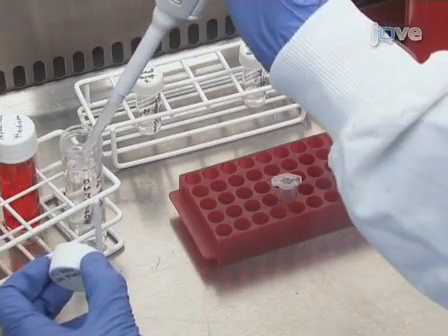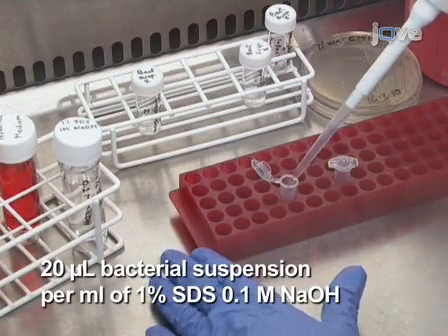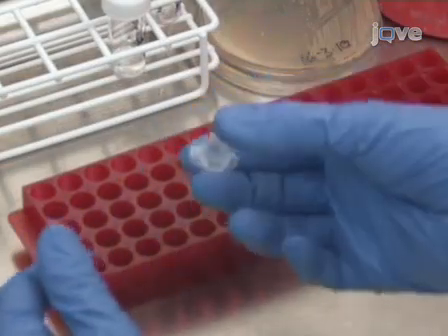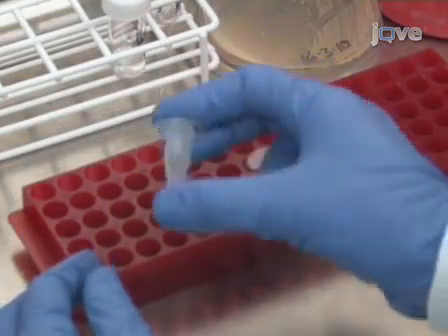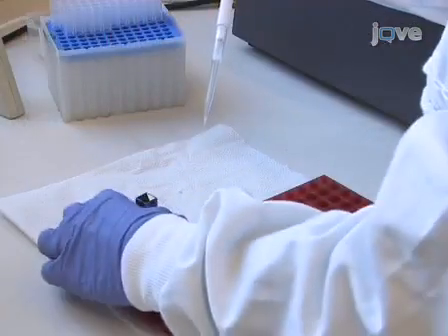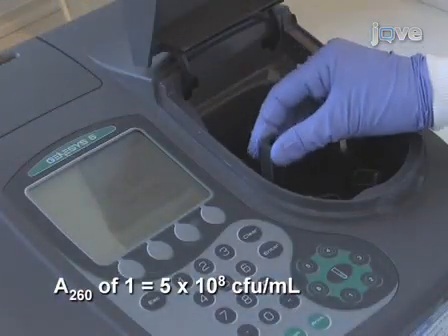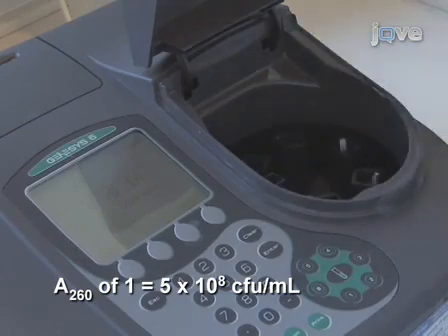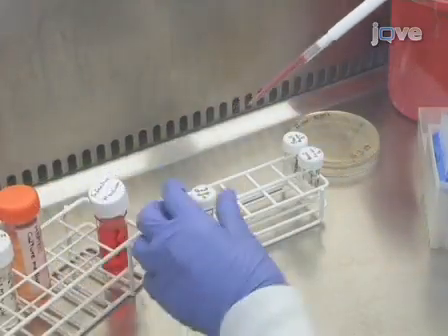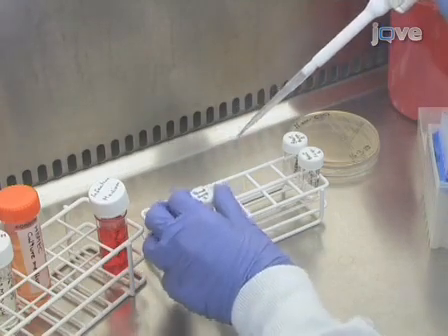Solubilize bacteria by adding 1 milliliter of 1% SDS, 0.1 molar sodium hydroxide to 2 vials containing 20 microliters of bacterial suspension and invert the tube to mix. To estimate bacterial numbers, measure the nucleic acid content by determining the absorbance of the solution at 260 nanometers. Adjust the bacterial suspension to the required density in infection medium for infecting the human brain microvascular endothelial cells.